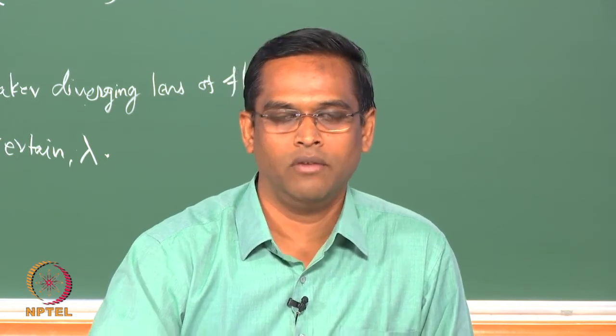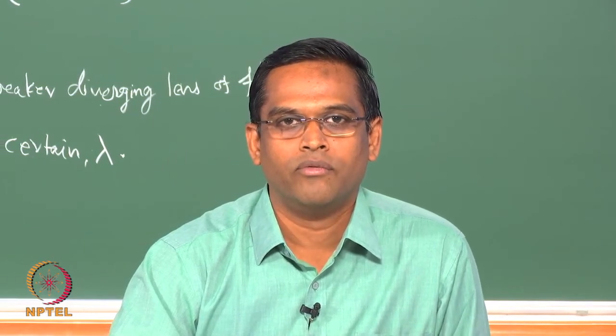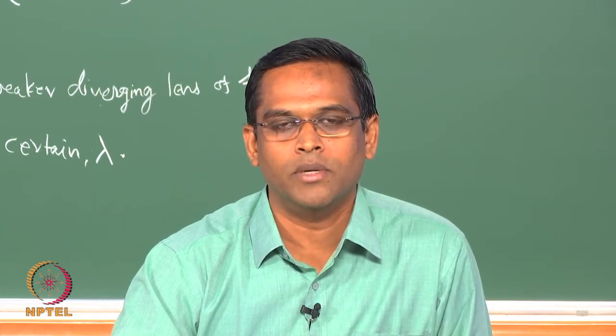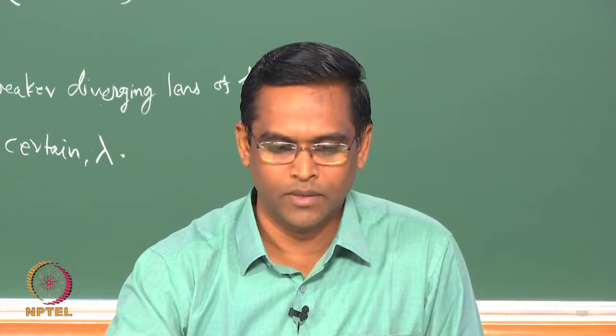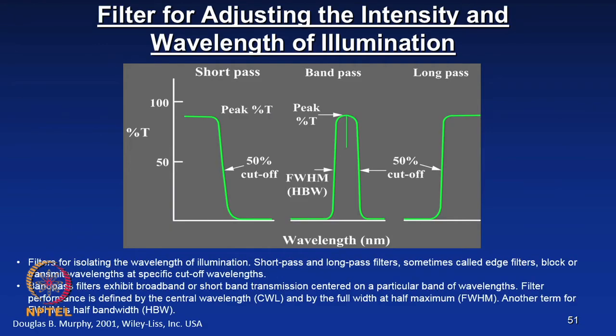If you recall that table which we have shown, the kind of useful magnification which the combination of these two apertures produces, now you will get an idea how the quality of a microscope is decided and how these two lenses, objectives and eyepieces, are selected. Okay. So now we will move on to some other important parts of the microscope.